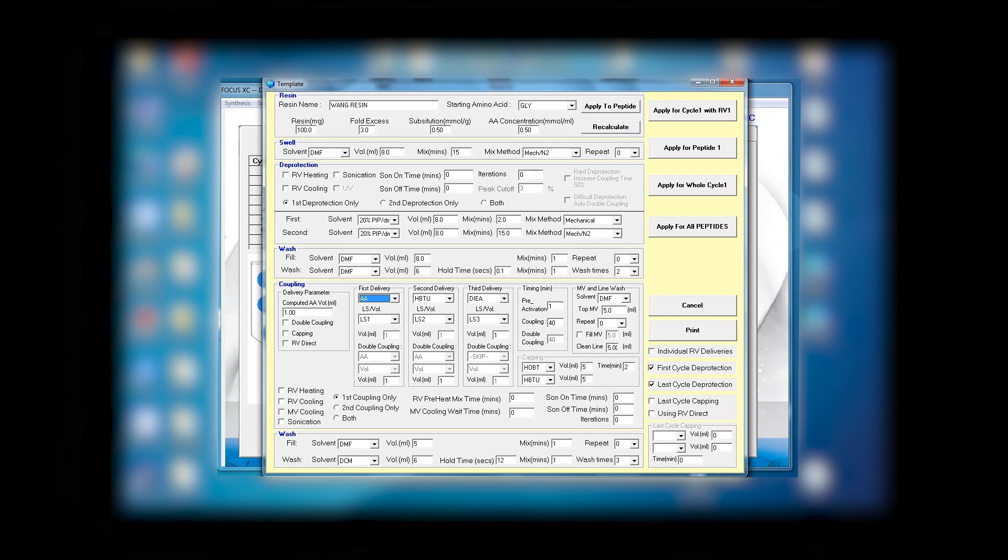Depending on the concentration and also the extra fold you want to use. The same thing with HBTU and the same thing with DIEA. Remember we recommend the concentration of these be 0.2 or 0.3 or maximum 0.4. DIEA could be twice as concentrated as an amino acid and HBTU.